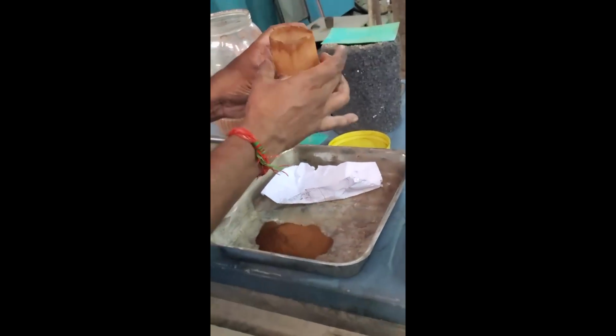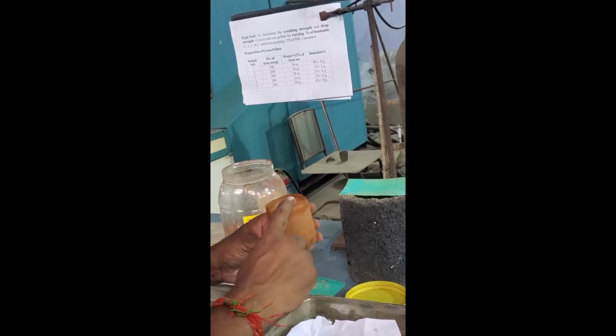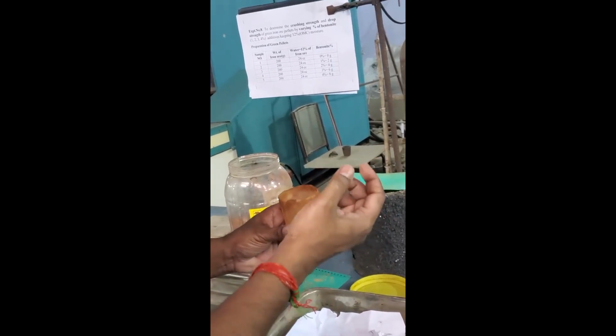You can mix manually also, but if you put this iron ore powder and bentonite in one container and shake or vibrate it like this, then it will be properly mixed. In that mix, if you add water, it will give you a homogeneous mix, meaning the bentonite will be mixed properly with the iron ore. You will get good strength. If you are not mixing properly, you may not get the best strength.